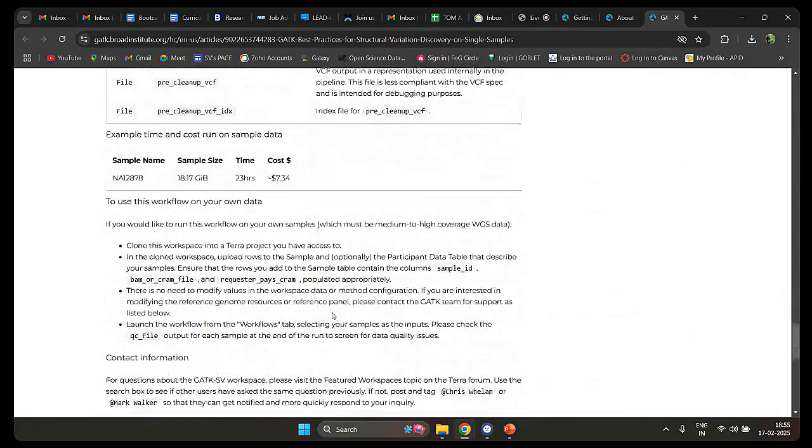It is just a software tool, but it has been implemented with Galaxy, so you can do it from your end. Once you have done the alignment, you can do the variant calling using the tool which is integrated with Galaxy. You can use that for the analysis.